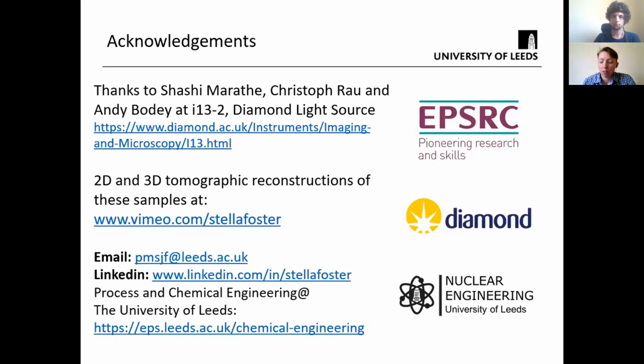In a wider sense, I really hope so, because there are a number of advantages that the synchrotron X-ray source has over lab-based sources. For example, the tunability of energy and a much higher energy, which is much more important in my case when I might in future have high mass elements in my samples, radionuclides. I'd like to think it would be, but the fact that there are so few synchrotrons means that I think lab-based sources are bound to play an important role as well.